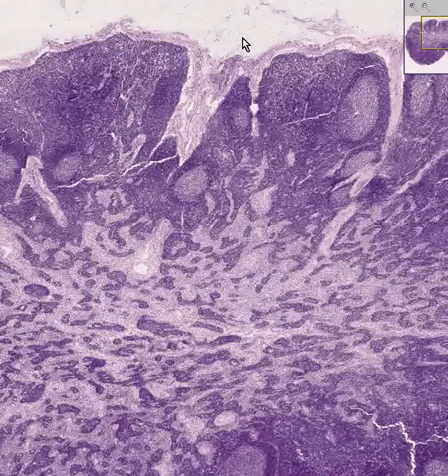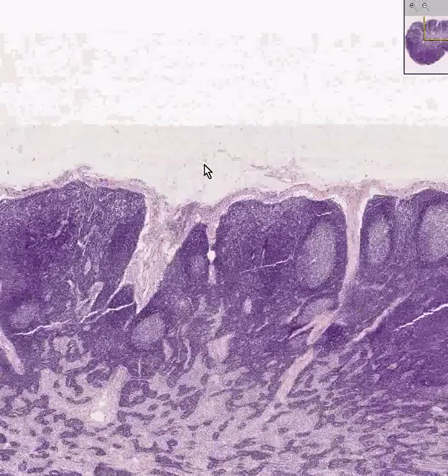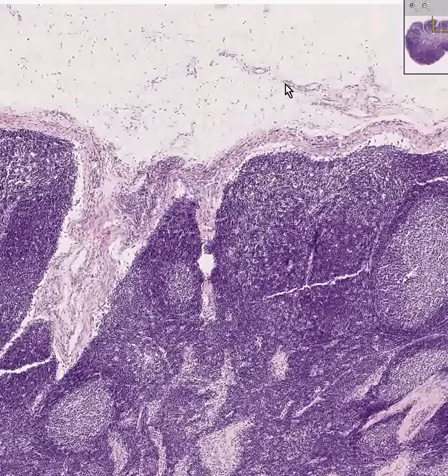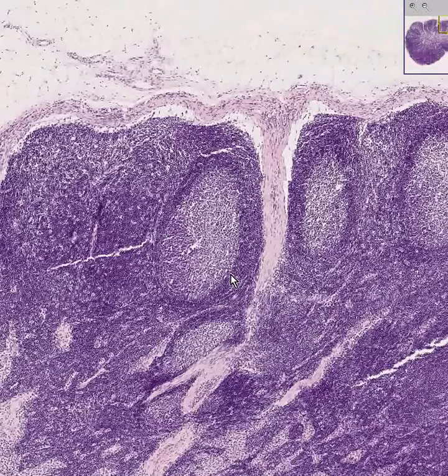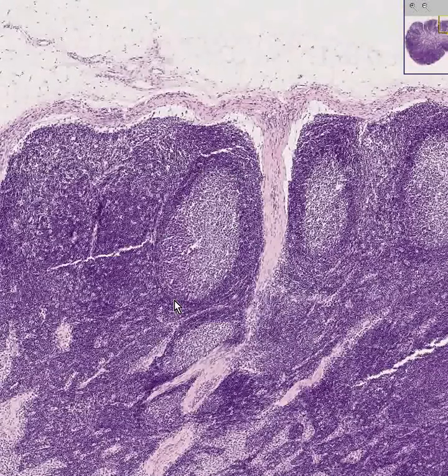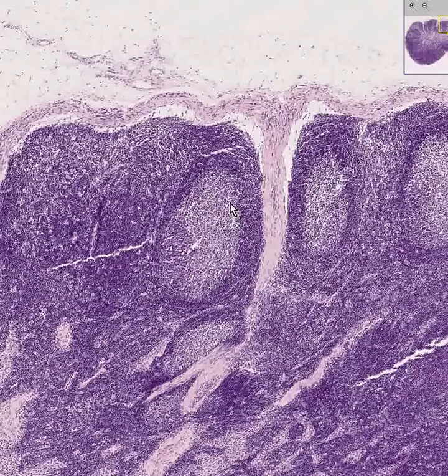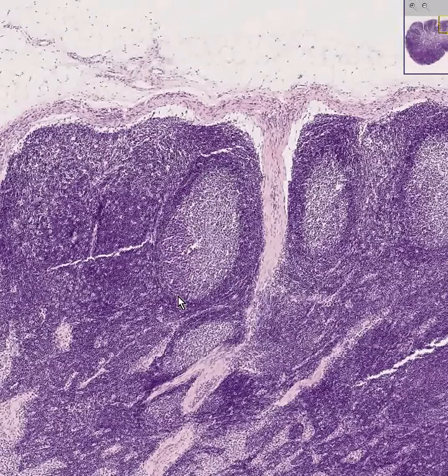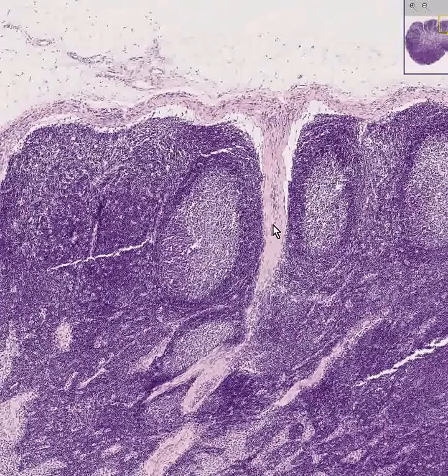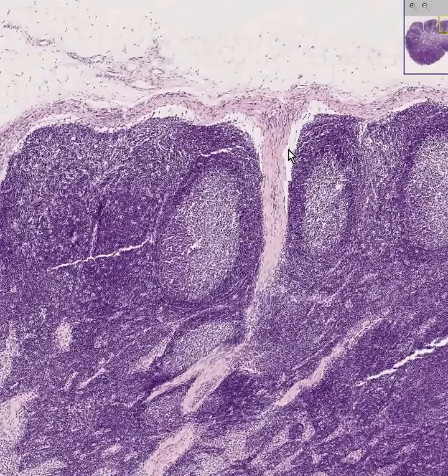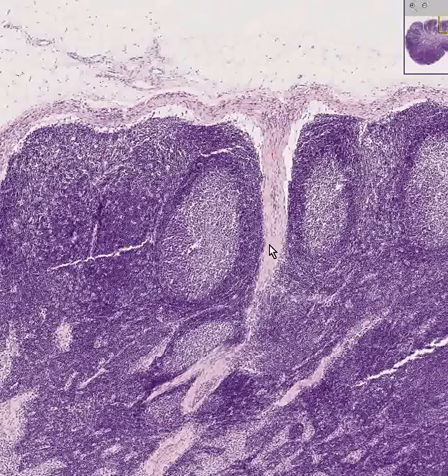Here is a little bit of fat surrounding the lymph node. If we blew this up, we could probably see that that's either a blood vessel or a lymphatic vessel coming into the lymph node. Here's a subcapsular sinus. Here is a secondary lymphoid follicle — also called a secondary lymphoid nodule — with the germinal center of lymphocytes on the inside and the darker lymphocytes, which have less cytoplasm, on the outside. Here is a trabecular structure separating groups of nodules.